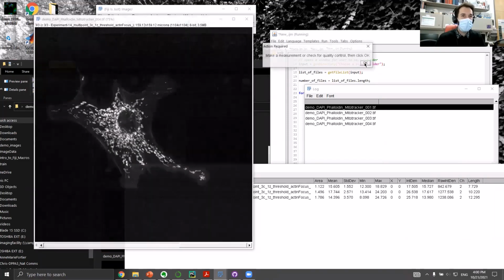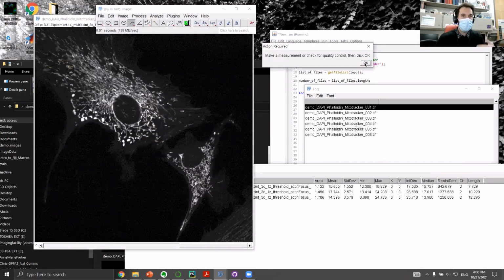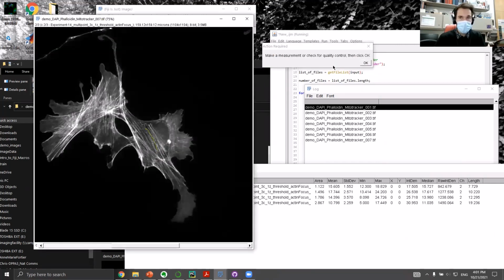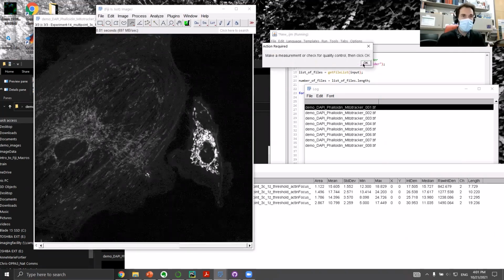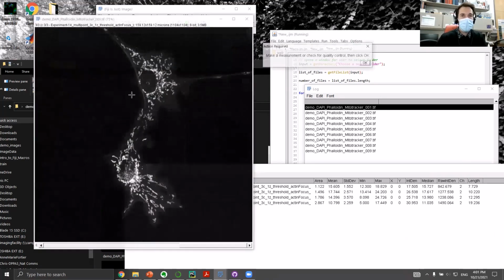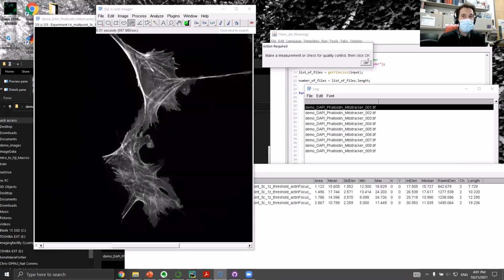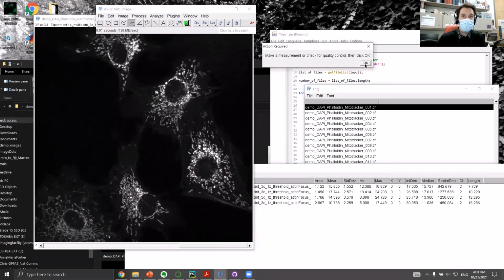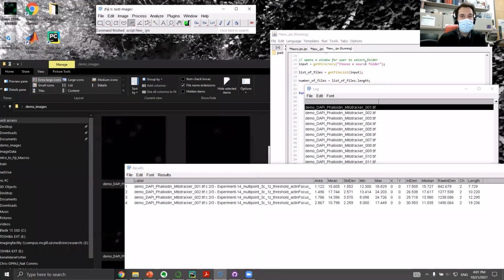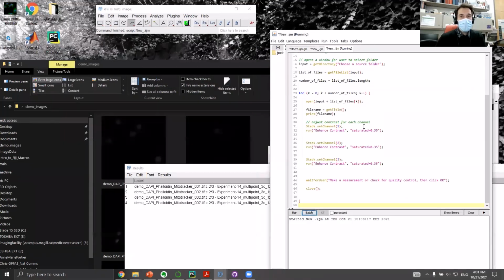And so you're just clicking OK. This wait for user just gives you a pause to go in and do something. Maybe this one, we'll say OK. Nothing good here. Well, this one's kind of funny. It's OK. And yeah, it'll just go through the whole folder. Where are we now? Almost done. There we go. And so this is really, really handy.